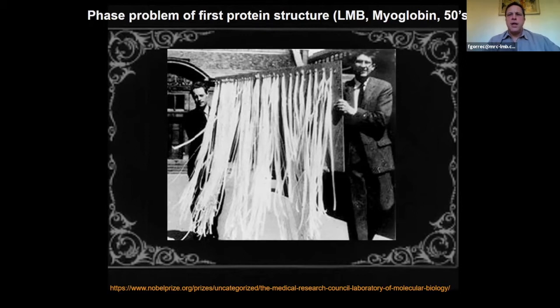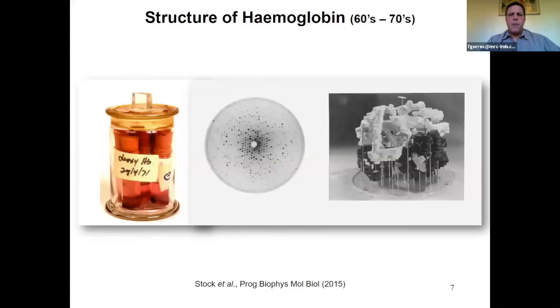They used readily available proteins, like, I think, the first protein structure was with myoglobin of sperm whale. And it crystallized relatively easily as well. So they didn't have the problems in crystallization at that time. And it evolved with the structure of hemoglobin in the 60s and 70s with the work of Perutz and Kendrew. And here is the flask again that we saw at the very beginning.